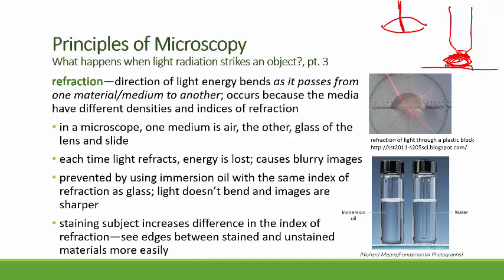And so because of this, when we use immersion oil, we prevent refraction, and the light doesn't bend, that light energy isn't lost, and the image remains sharper. So doing something to overcome refraction can help produce sharper, better quality images.